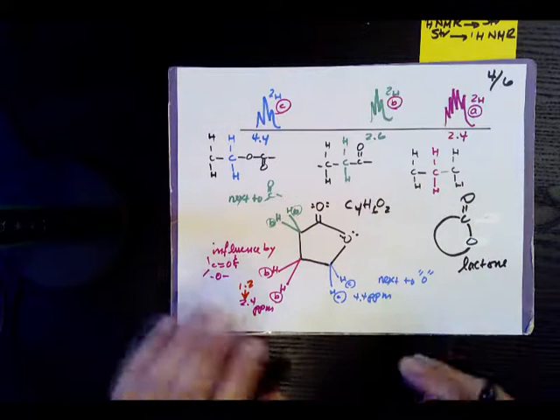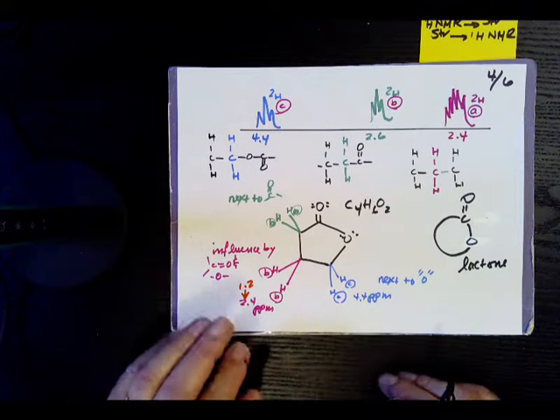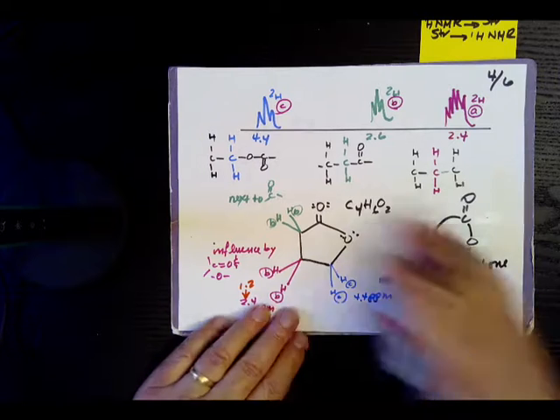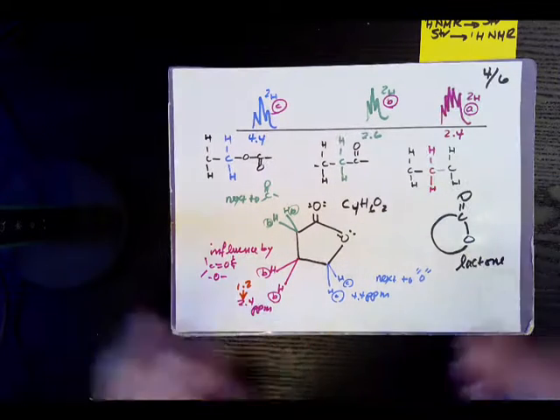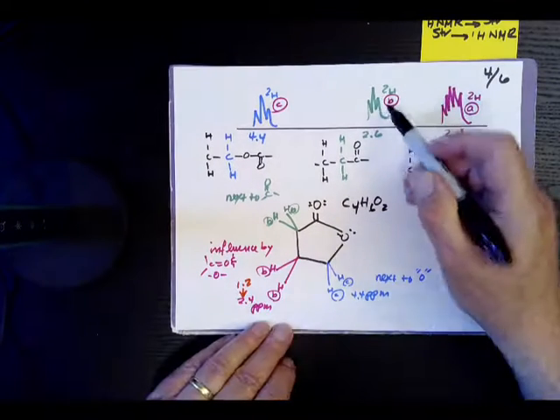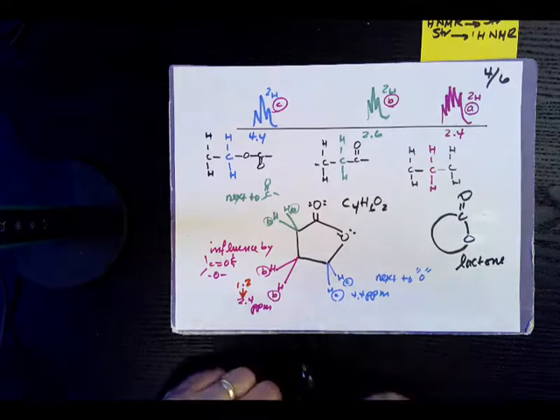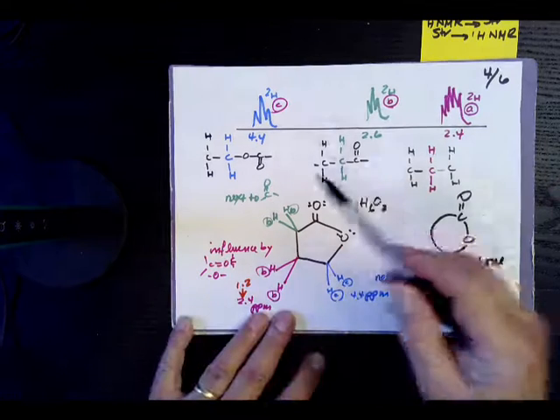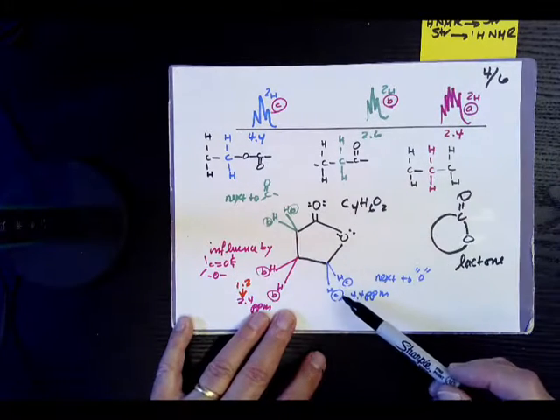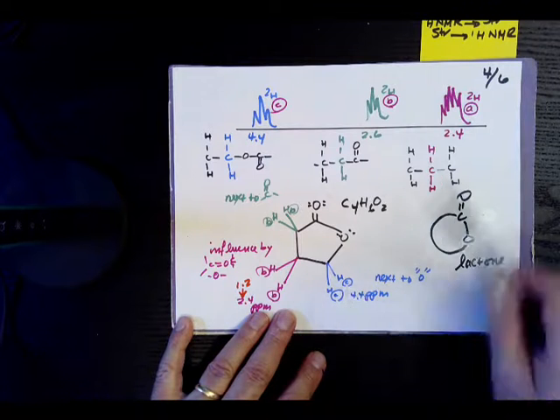We have a good idea of the blue one. Again, I repeat the spectra here so I can look at it. And we have a good idea on the green one, so we can put those on first. The blue one is the one next to the O, which has the highest ppm, or is downfield.